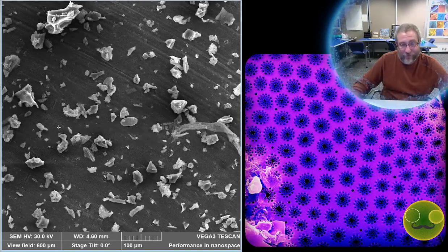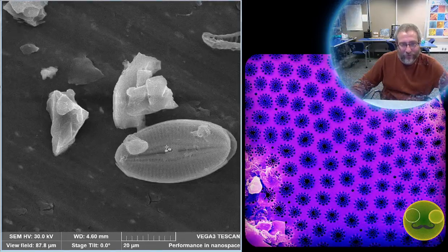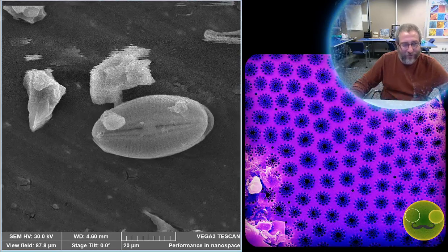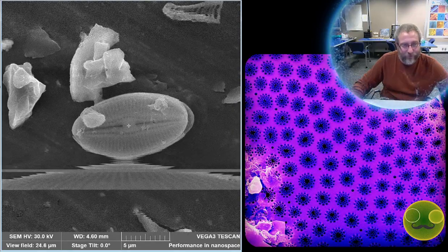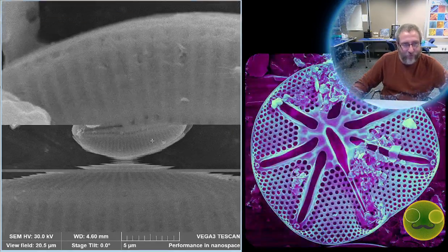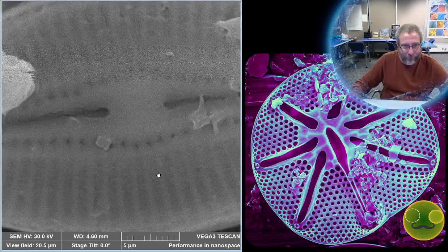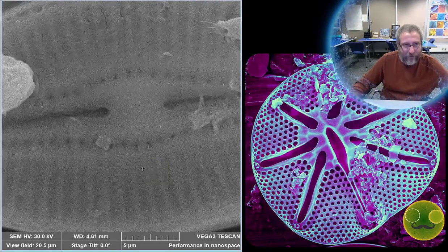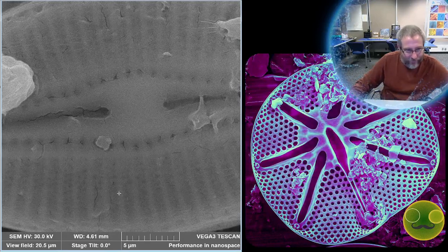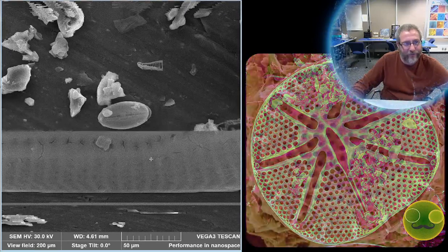And as it splits and regenerates itself, basically, you can just chill out in there. Stay in your little environment and stay safe. So this is another diatom. This is a diploneis, and my very good friend Itzy is a specialist of diploneis. This one's a little ratty, but I just wanted to see if we could see some of the structure. It's got some clay on it, and I don't think we can because there's a little too much clay.